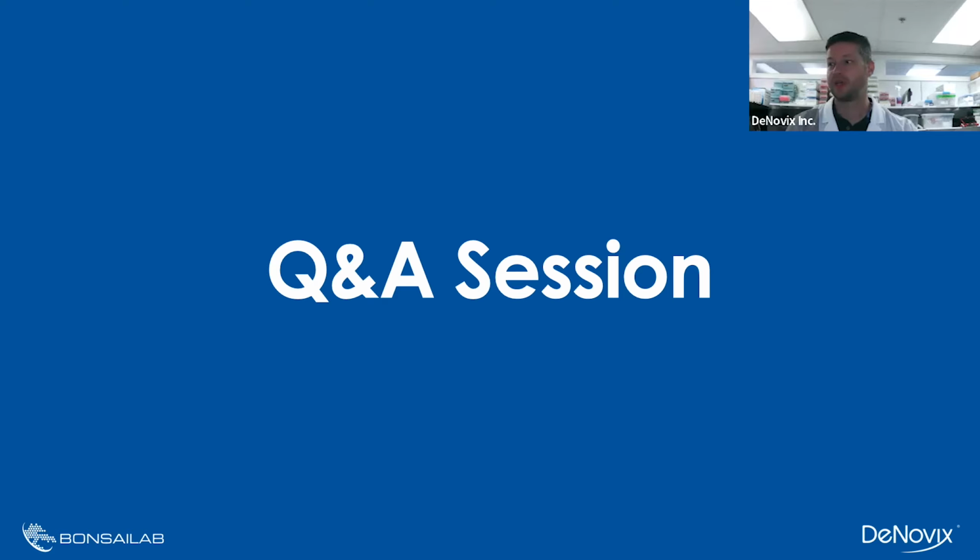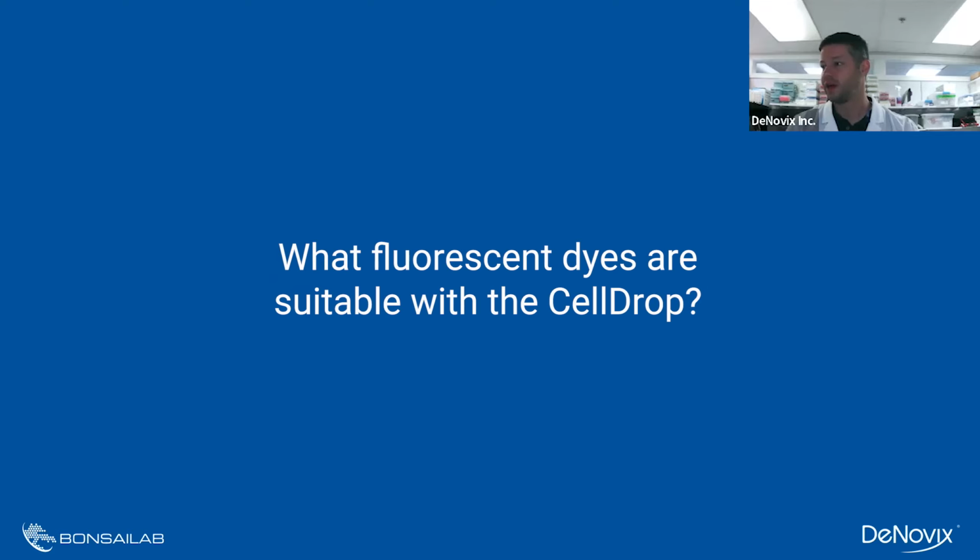So I'm going to answer the first question here. What fluorescent dyes are suitable with the CellDrop? The CellDrop was really designed to work specifically with the AOPI dyes. Some other ones that happen to fall in the same excitation emission range would be GFP, fluorescein, and CFDA. Off the top of my head, those are the ones that I know. The excitation and emission for the CellDrop are available on our website, and if you want to check other dyes, it's very easy to do so if you have the excitation and emission ranges of those dyes.